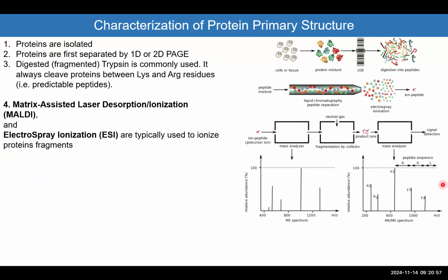You could also do that by bulk analysis, similar to how we performed bulk RNA-seq and bulk sequencing of DNA. You would isolate the proteins from cells or tissues from different conditions, like diseased or not. Then you would run those on a gel. We will have an introduction next lecture on how we generate these gels and how we run the proteins in a Western blotting setup.